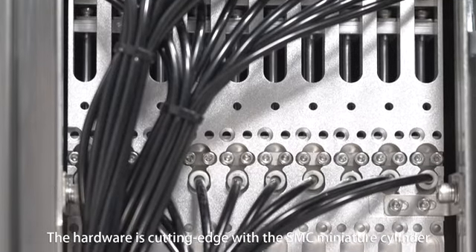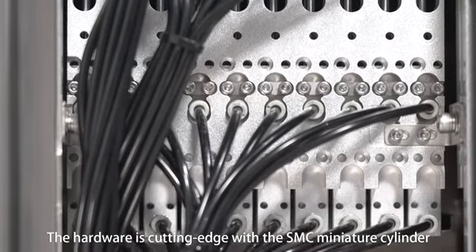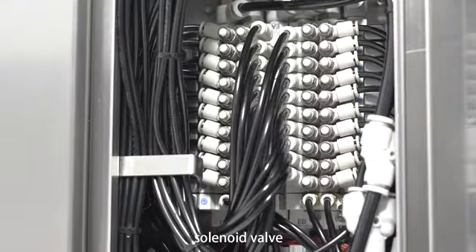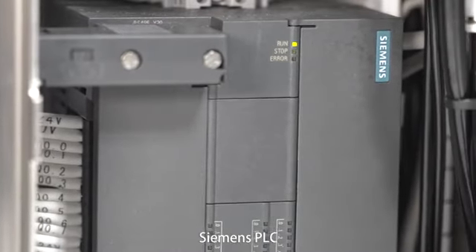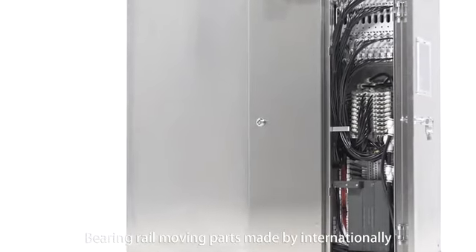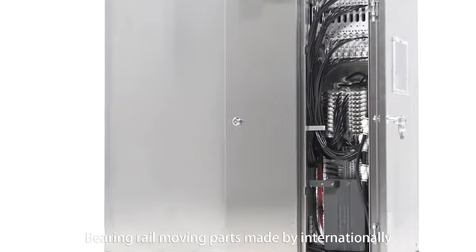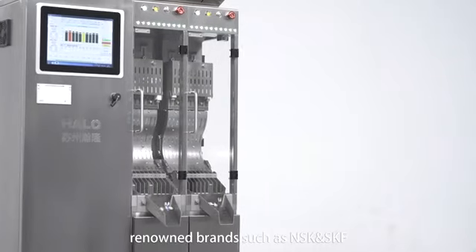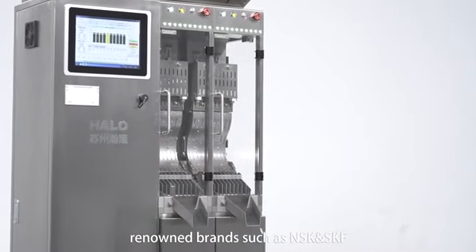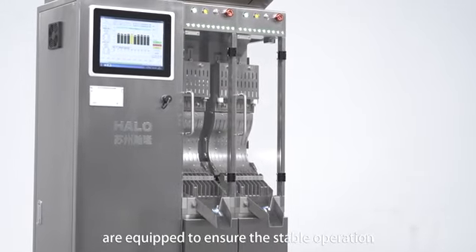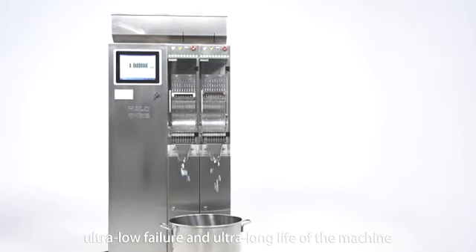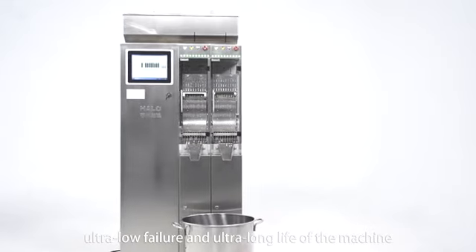The hardware is cutting edge with the SMC miniature cylinder, solenoid valve, Siemens PLC. The bearing rail moving parts made by internationally renowned brands such as NSK and SKF are equipped to ensure the stable operation, ultra low failure and ultra long life of the machine.